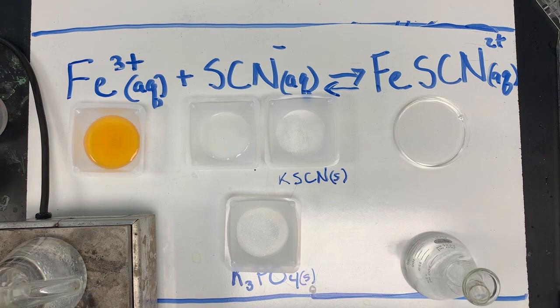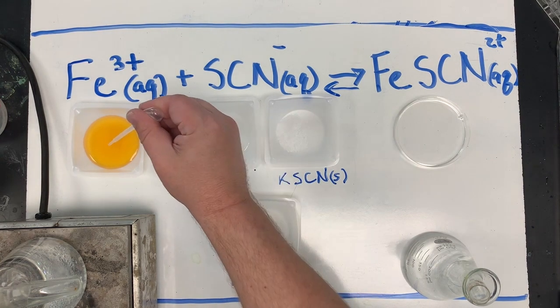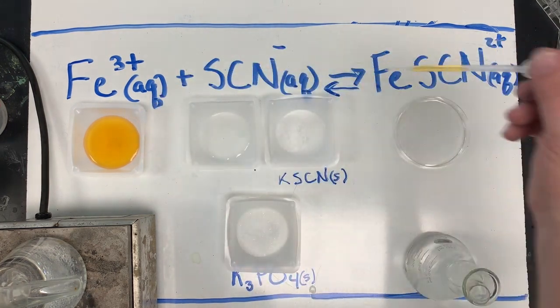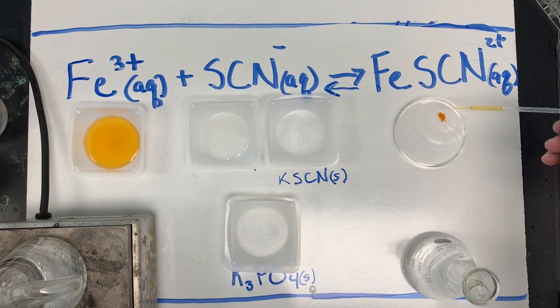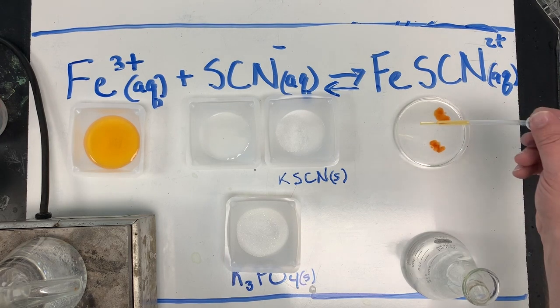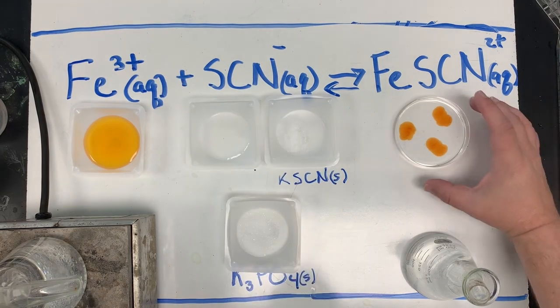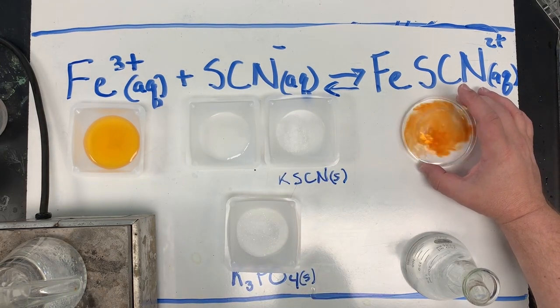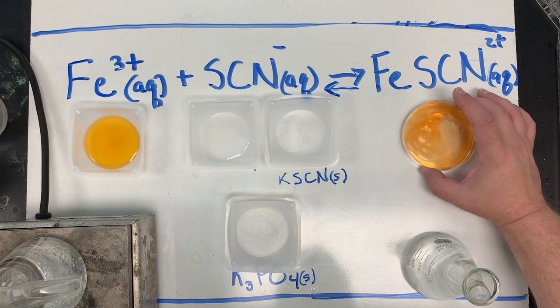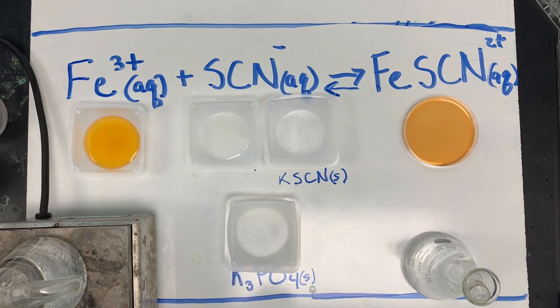I'm going to take a pipette and add three drops of our iron. So we're going to add the iron to the solution. We'll go one, two, three. You'll notice there's a color change already. As I swirl this to get it all mixed together, you can see our solution is a darker color.